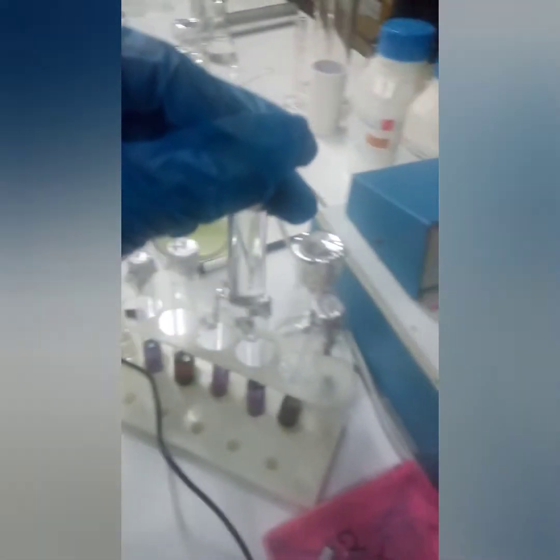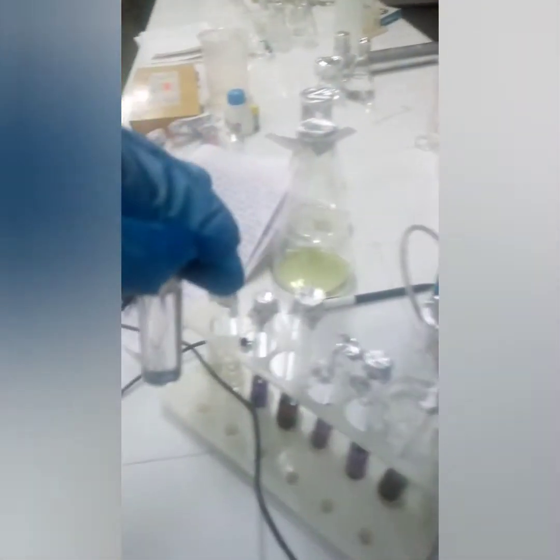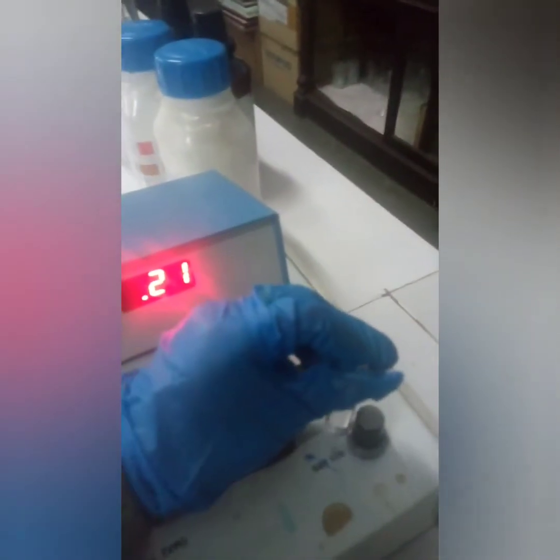For taking the OD reading, the absorbance reading, this is the colorimeter tube. We will pour the blank first into this colorimeter tube, and then we are going to use this colorimeter instrument.